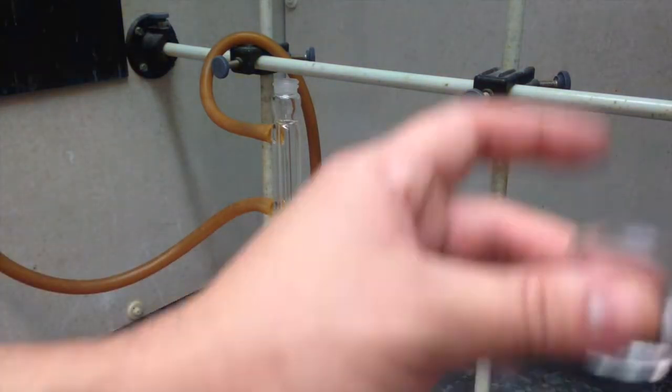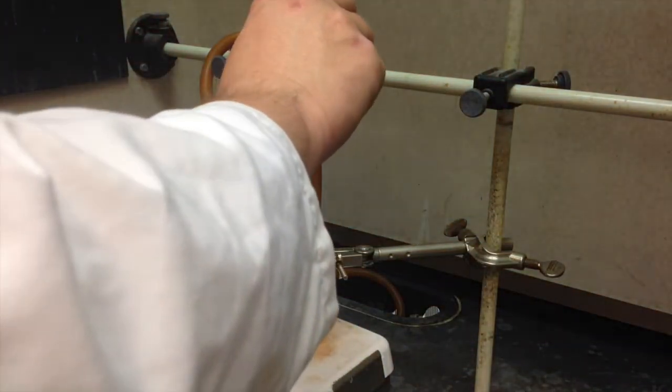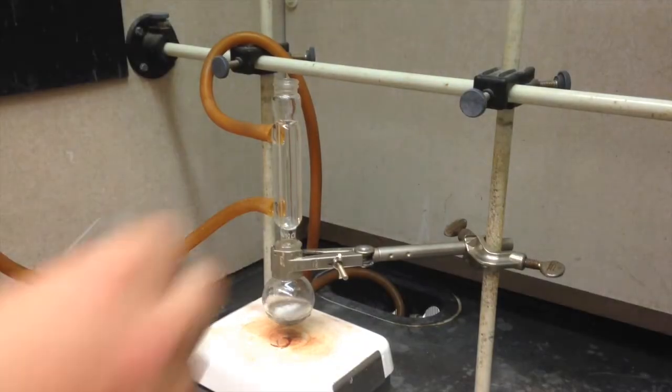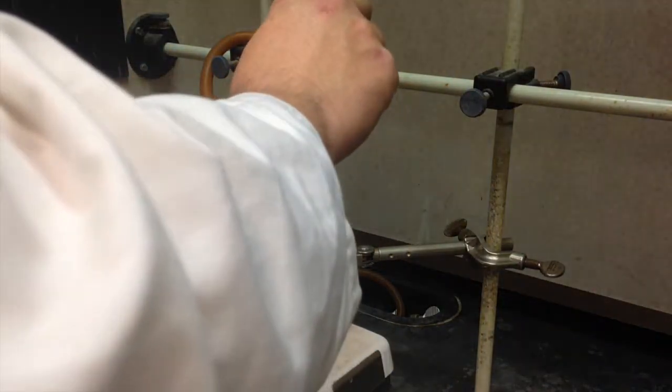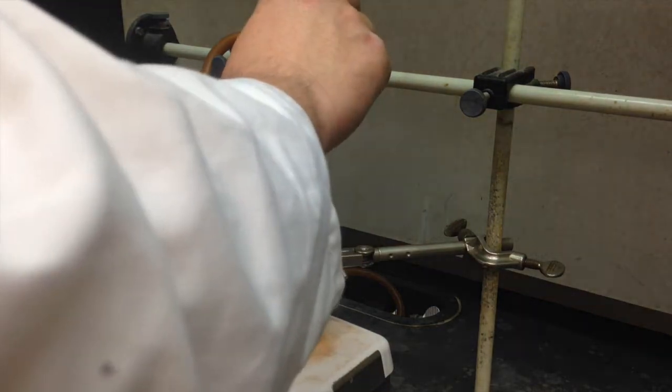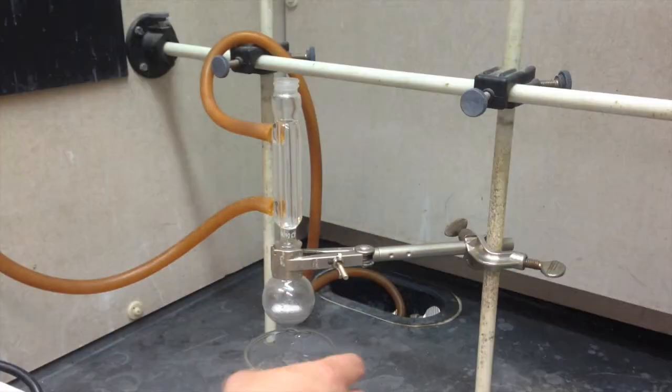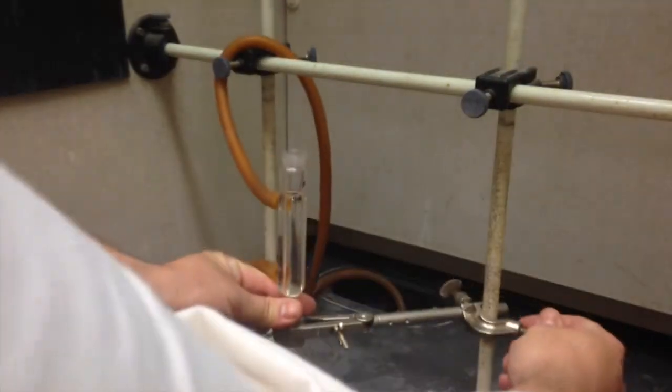When we're adding the acetone solution, we want to do this slowly. Either tip it over really, really slowly in really small increments, or use a pipette. Either way, it might spray out, so keep checking the temperature of your round bottom. Now with the second part of the reaction done, we'll move on to the third, the acidification.